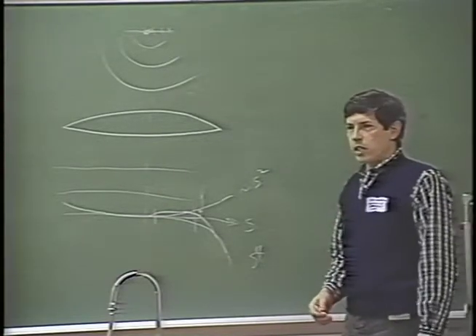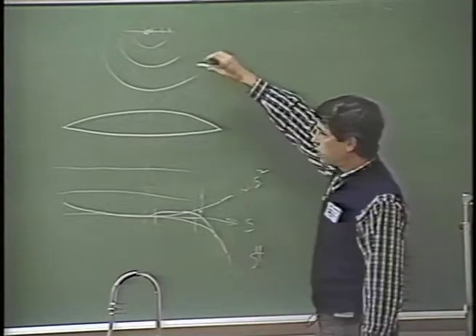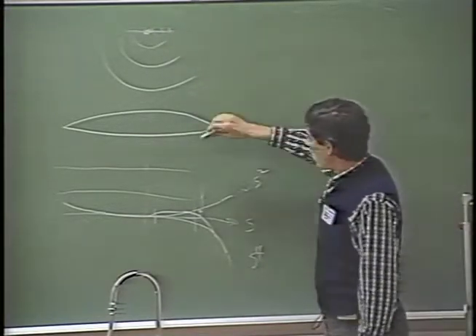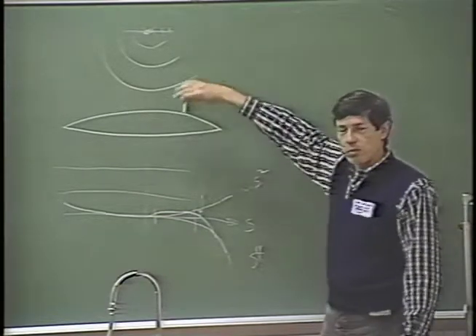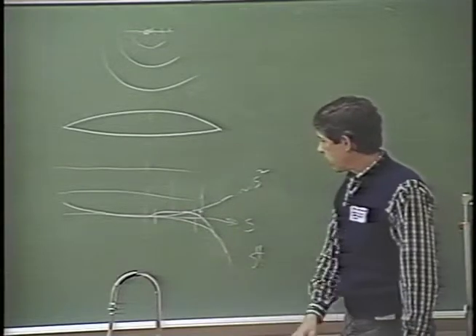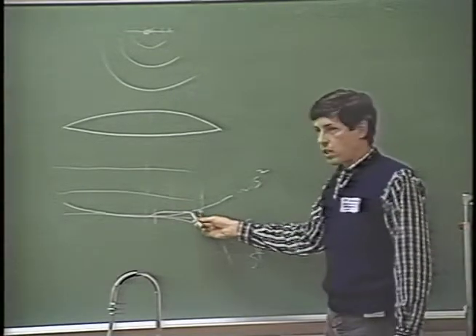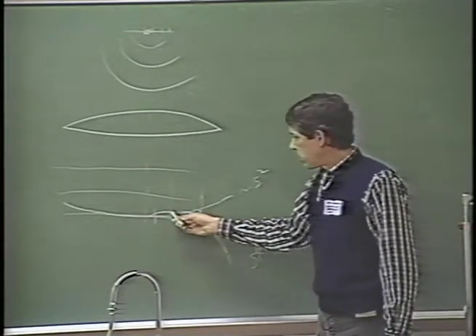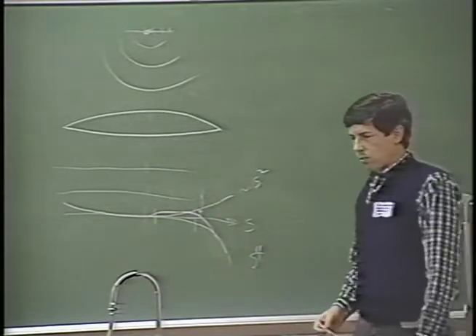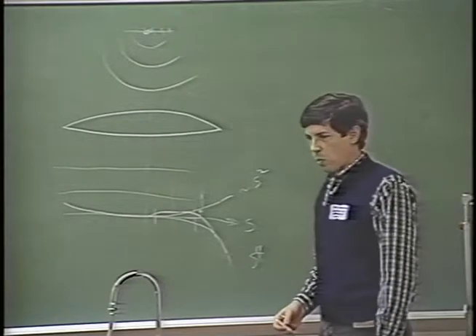At 400 kV instead of 100 kV, the scattering is reduced. The scattering angle is reduced because the wavelengths are much shorter, and these diffracted beams at 3.5 angstroms will come in somewhere in here. And in fact, you can arrange to get this good region of the good phase shift out close to 2 angstroms, at least sort of around 2.5 angstroms.